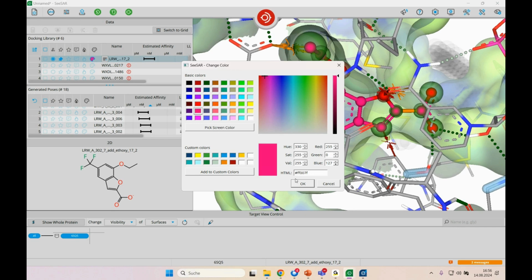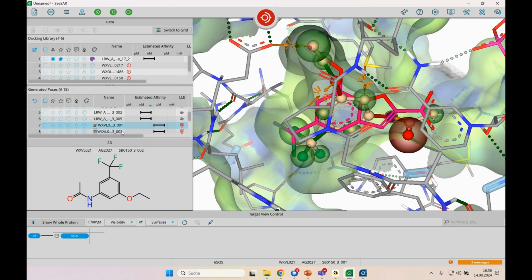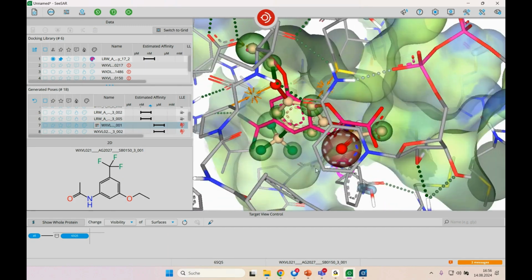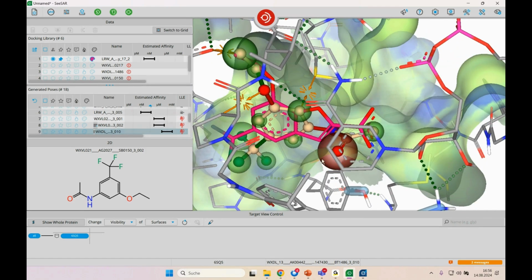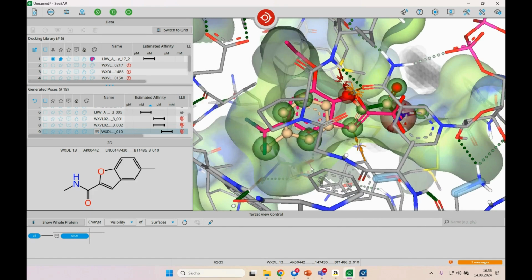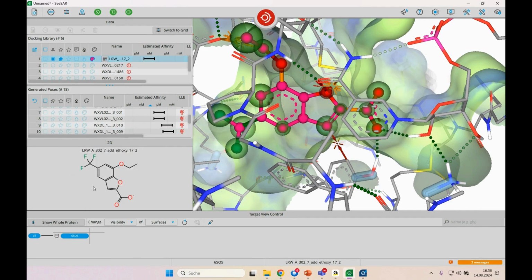So yeah, but you see, the amide is not well tolerated, at least in this regard. So unfortunately for the fast one, not so many nice surprises there. But honestly, we got some pretty nice ideas how to actually grow this fragment. So therefore, I would say I'm fine with how far we've come within this hour.